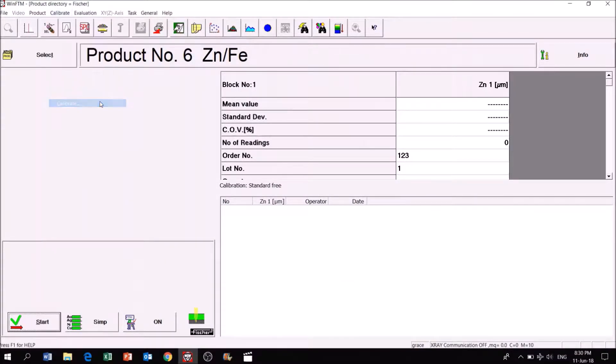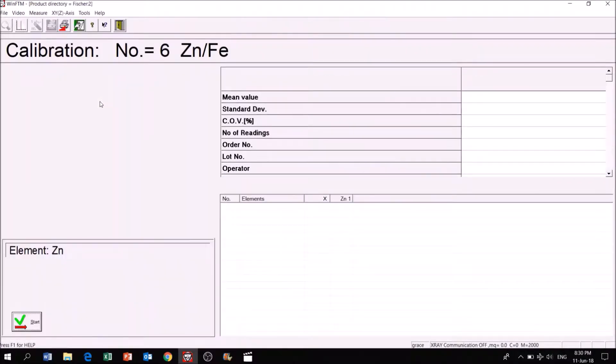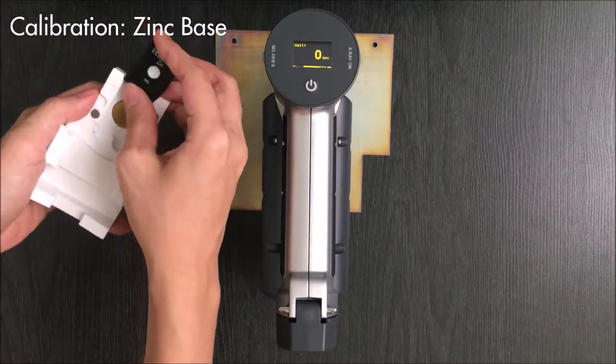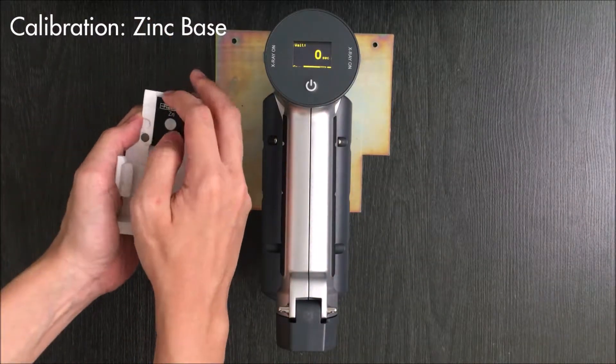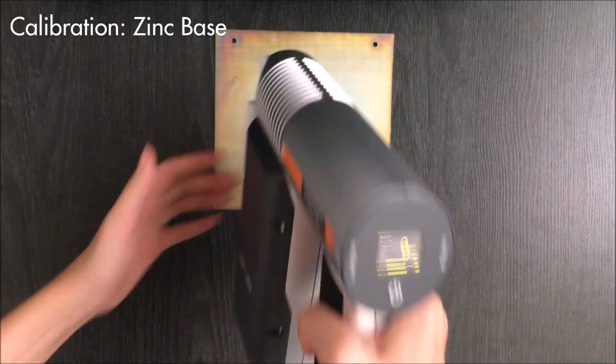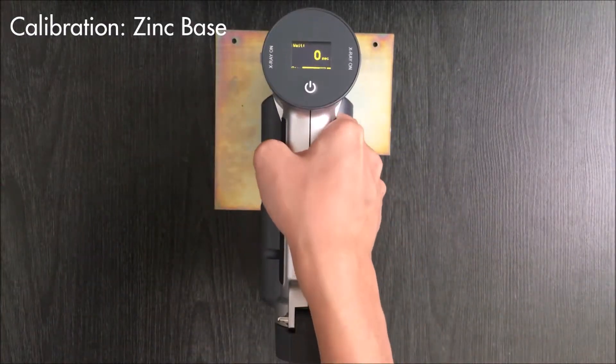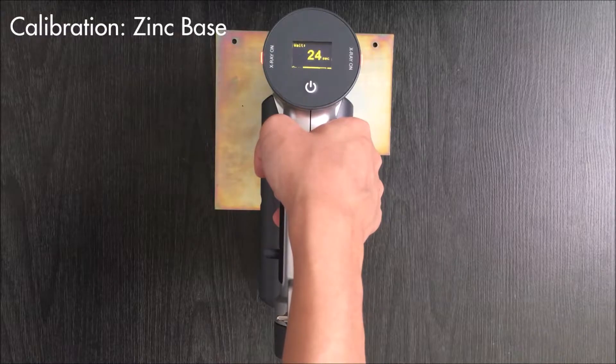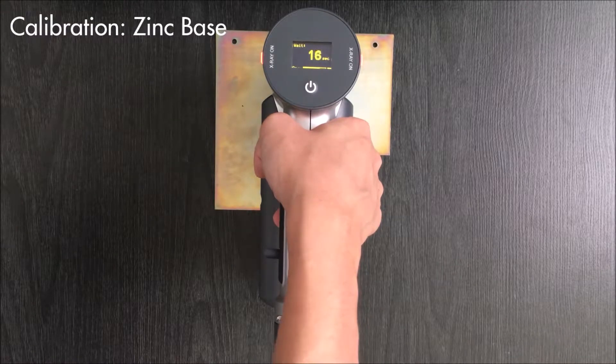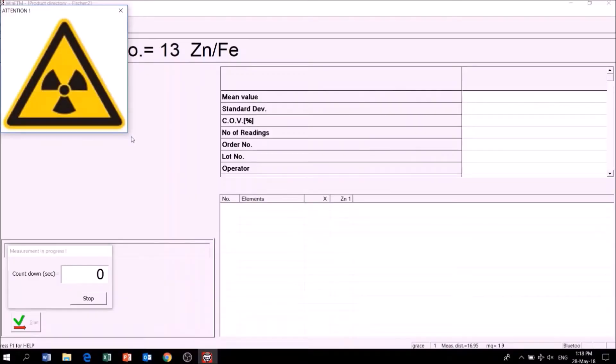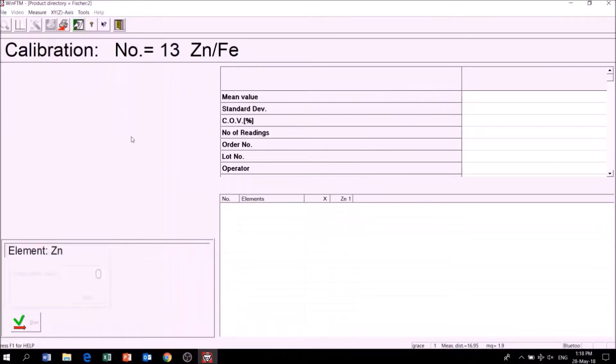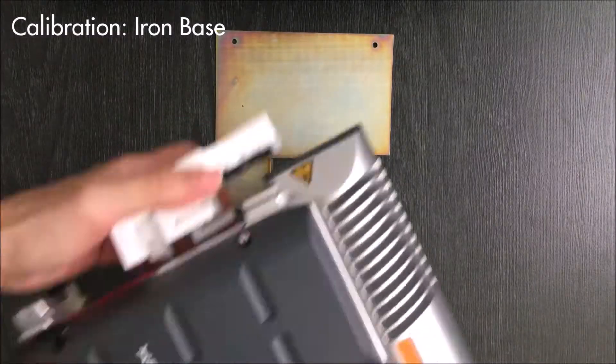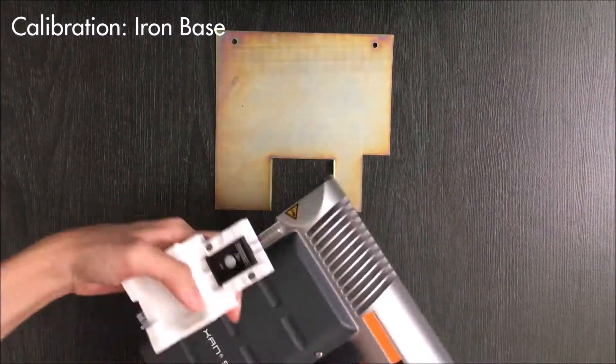First, I will calibrate the instrument with a zinc base. Next, I will calibrate the instrument using an iron base.